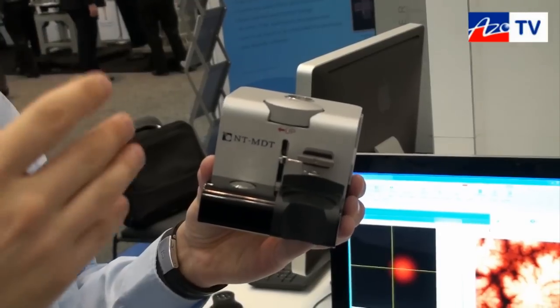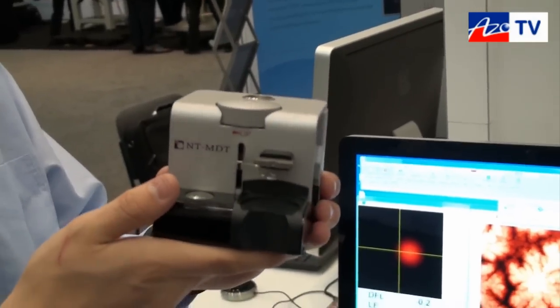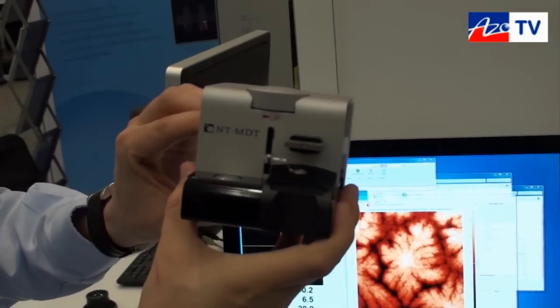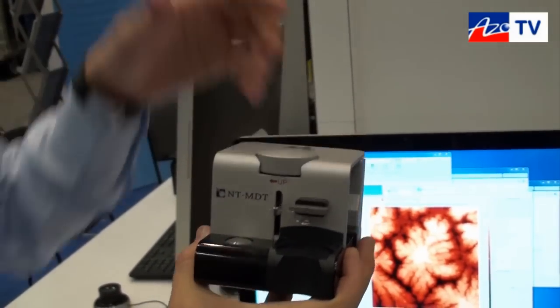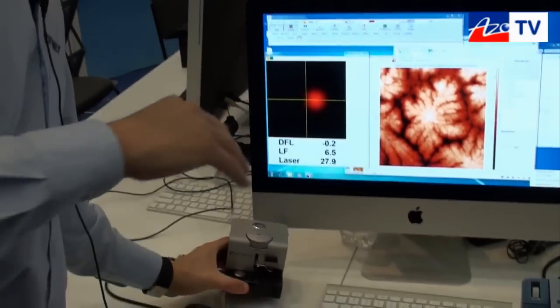This makes it really much cheaper, and for education it's a really good value. With the etching device, you make the ring with the solution, push the button, and get a new tip attached. There are many more things I could say about Solver Nano, but thank you for your time.